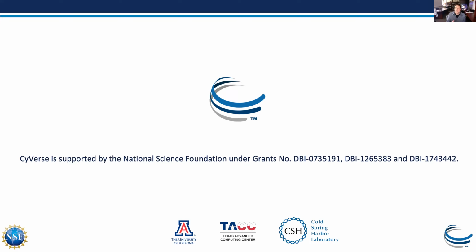I think that's under section 5 or 6, the data tracks, or maybe even earlier. So I would start there. If we had more time, we could skip through and find that, but I'll try to keep it more concise and not wander off.